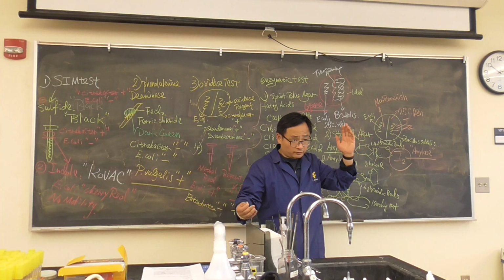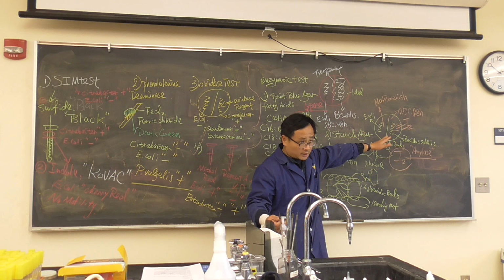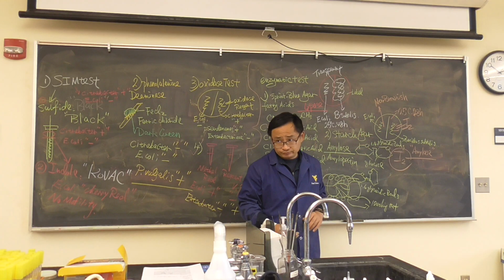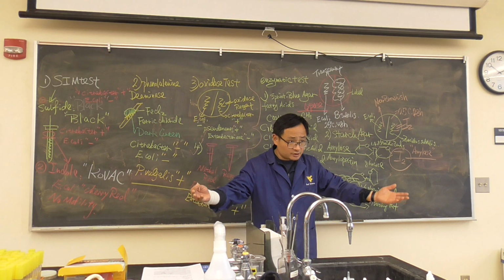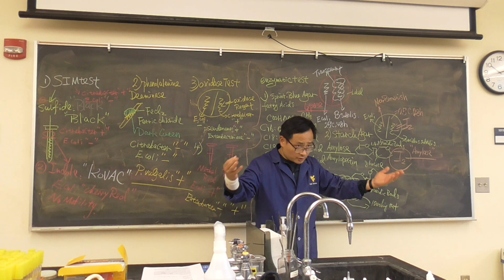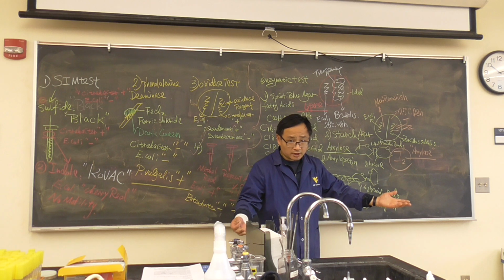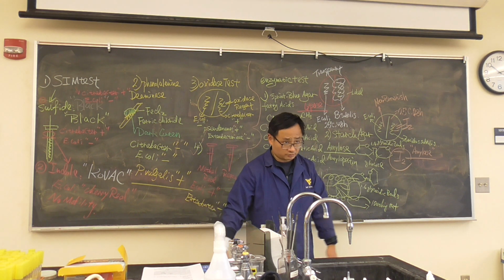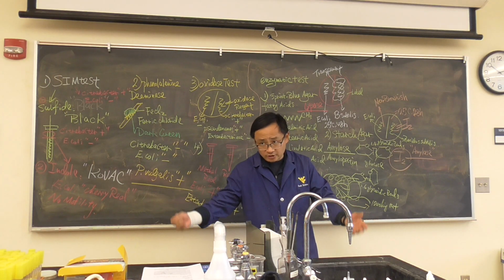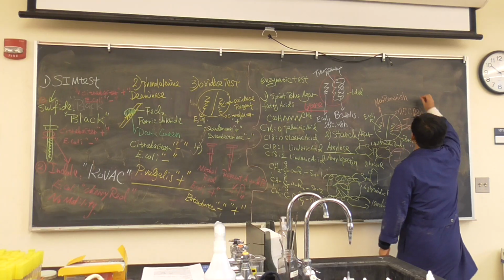If you add iodine and you see brownish color, it means starch has not been used. So amylase test negative. And once you see the area with no brownish color, it means starch has been broken down, becoming glucose. So that's amylase test positive. Okay, so that's the one.